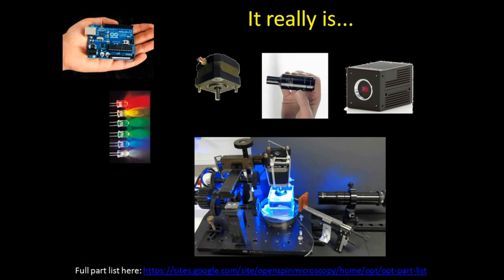You can just collect the fluorescence here in between the two lens system. You can place a filter for fluorescence, and you get just the green out of fluorescence. Practically all of the images that I'm going to show now are autofluorescence images. It's just the fluorescence that the tissues have after you prepare them.